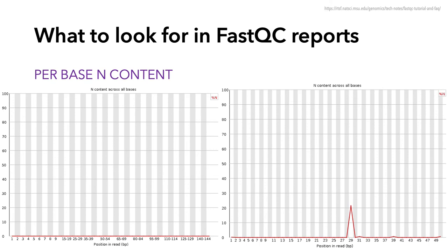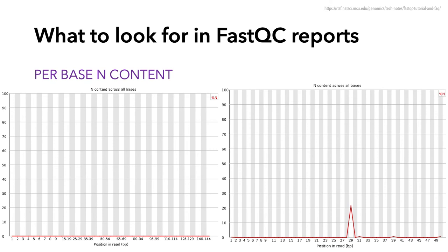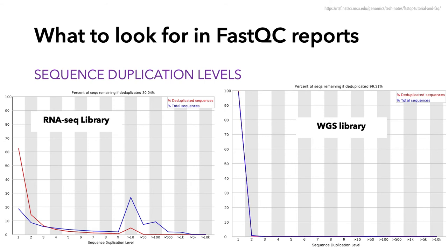The per base N content, where N stands for no base call, is a pretty simple plot. You should have a flat line, like what you see here. If you see any spikes above zero, this indicates instrument error during sequencing.